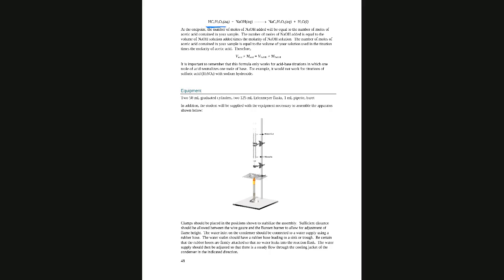You have seen neutralization in Chem 1. So if you see, this is acetic acid. That's the only one that's going to titrate the acid, but you are going to do it 3 times. You are going to calculate the initial concentration of acetic acid with a titration before the reaction starts. So basically, you mix the acetic acid and the ethanol, but you don't add the catalyst.